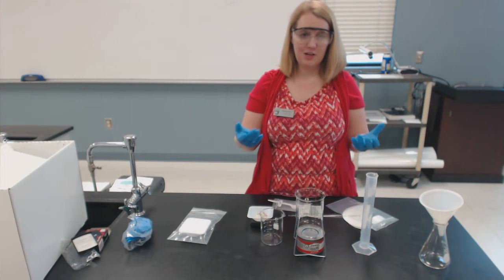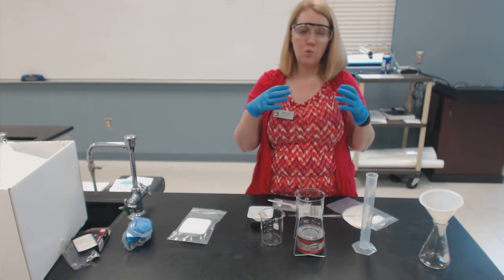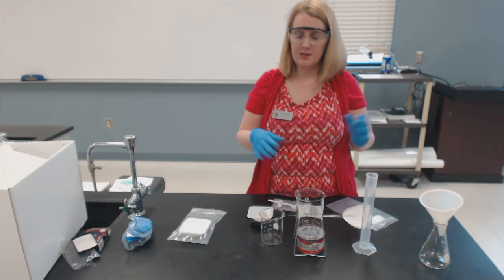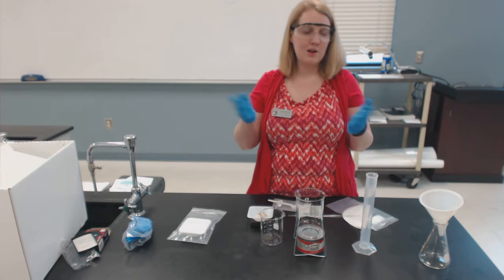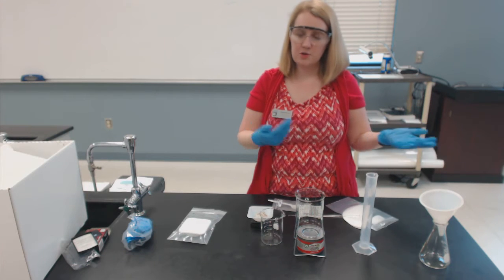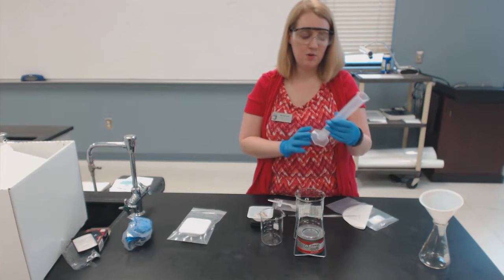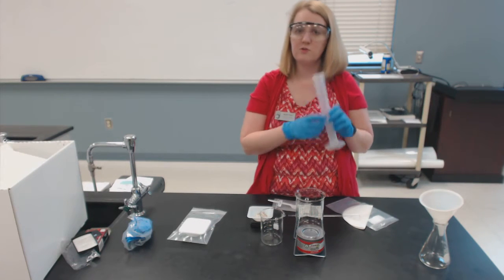Be specific in your lab report of what each step entails. Never say something vague like, "step 4, add water," because then the person who's trying to copy your results doesn't know how much water to add. So say, okay, step 4, add 50 milliliters of water.